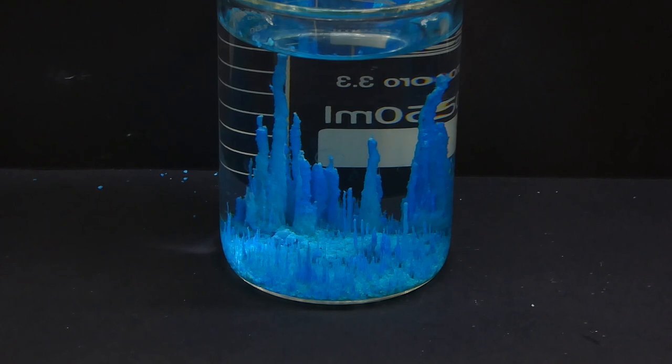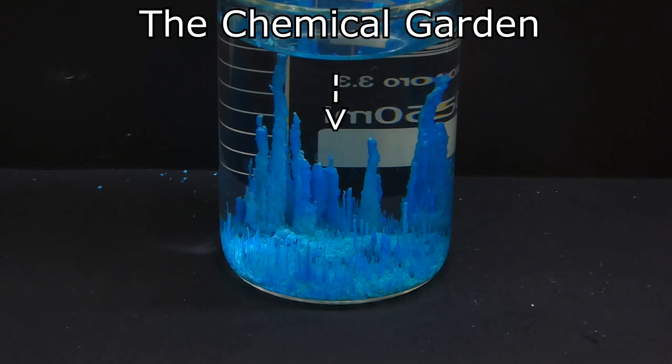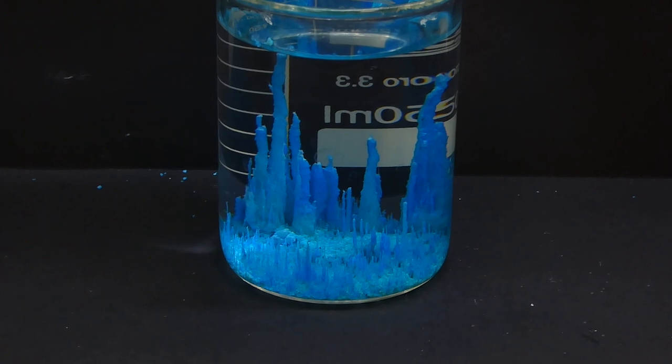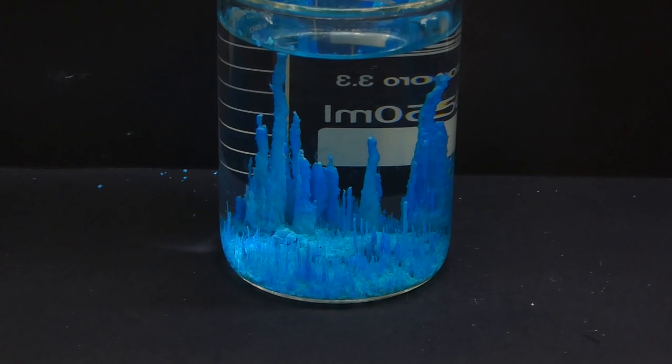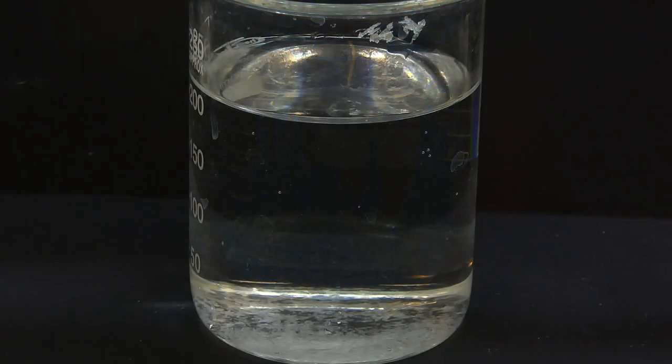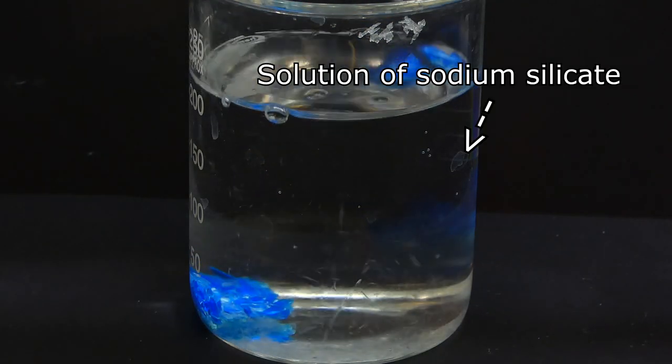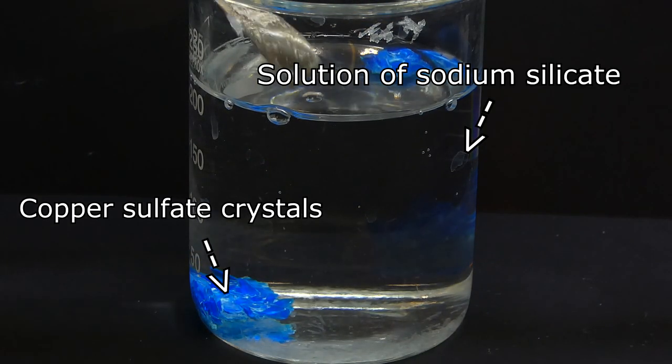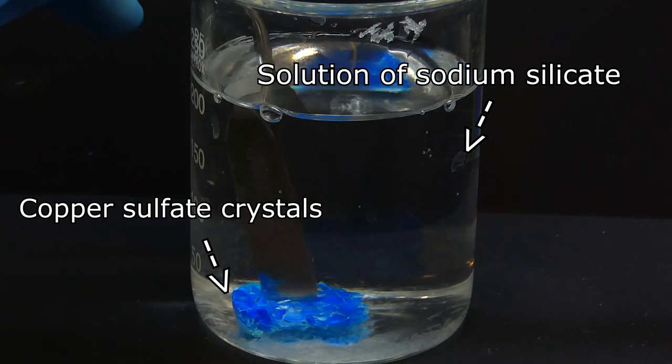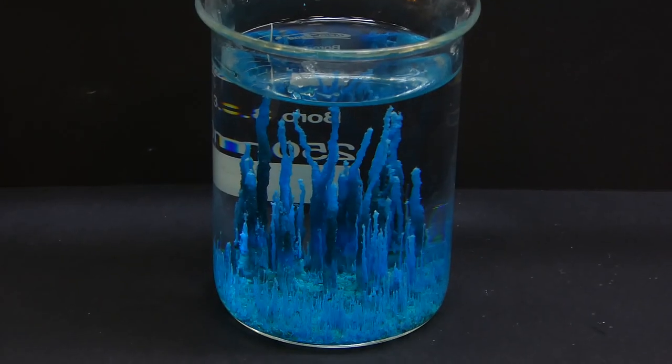Some of you might have heard about an experiment called the chemical garden. It's not super popular, but it can make some beautiful decorations and it's very easy to do using just home chemistry. The experiment is composed of firstly making an aqueous solution of sodium silicate and then dropping some metal salt crystals into it to produce some nice looking structures, which can look like a colorful garden.